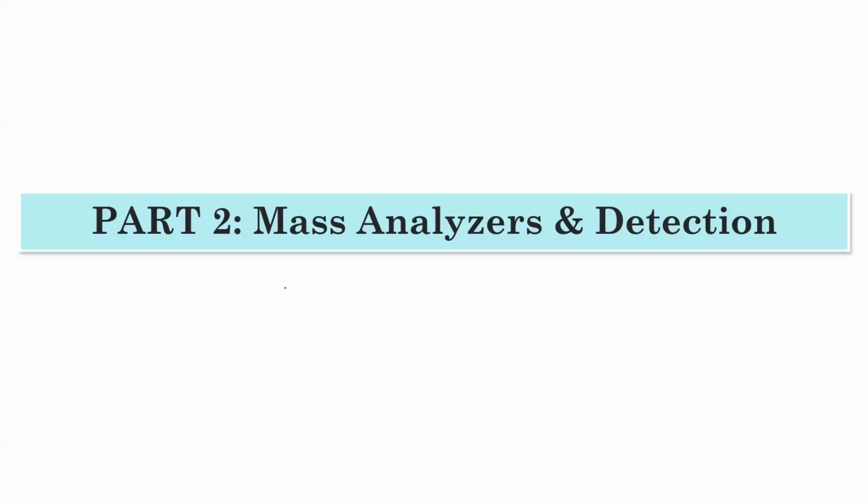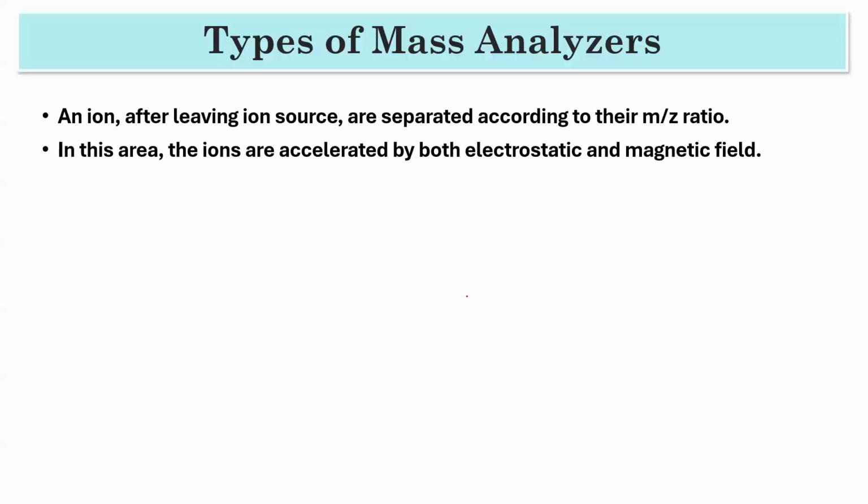Okay, so let's move to the mass analyzer. After you send your sample to the mass analyzer, it should happen only when your molecule is ionized.